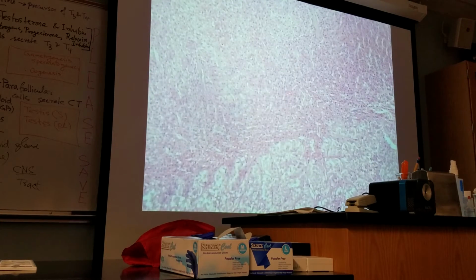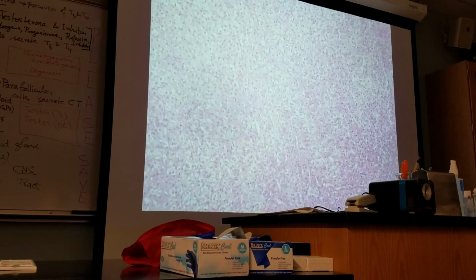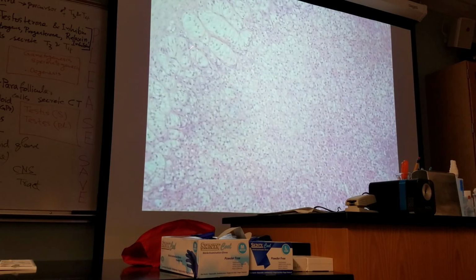Example of gonadocorticoid hormones, androstenedione, or just androgen. Androgen will be good enough. Okay? Adrenal gland is done. What you need to differentiate is adrenal cortex and adrenal medulla, and also the different zones or regions of adrenal cortex. This is zona reticularis, zona fasciculata, and zona glomerulosa.